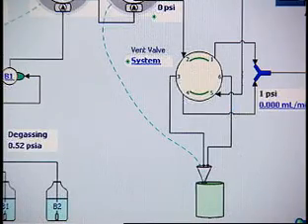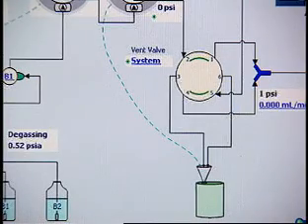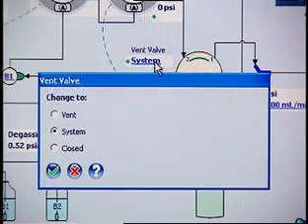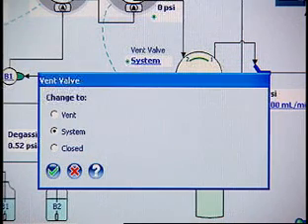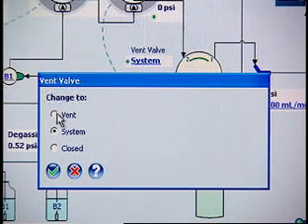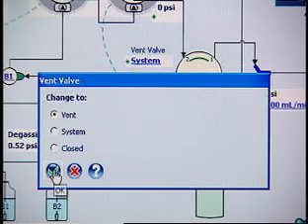Ensure the vent valve is set to Vent. If it is not, click the Vent Valve status field. The Vent Valve window appears. Select Vent and click OK.